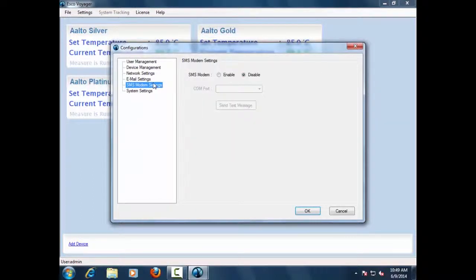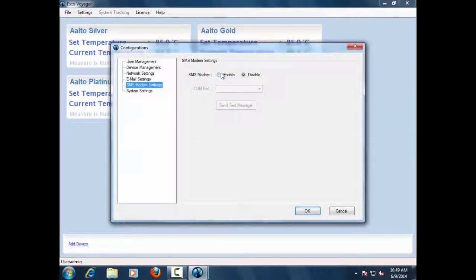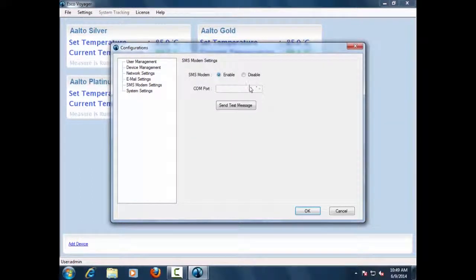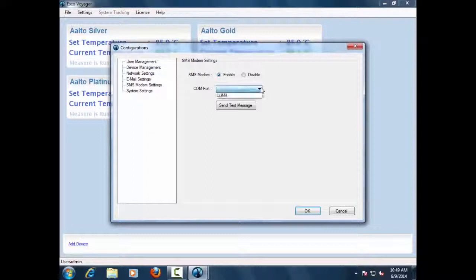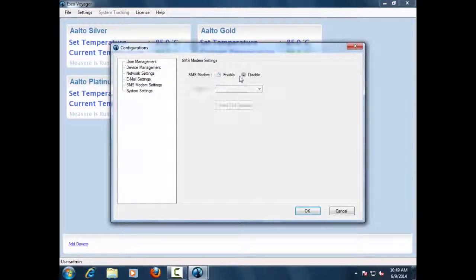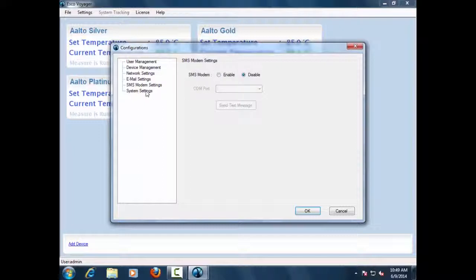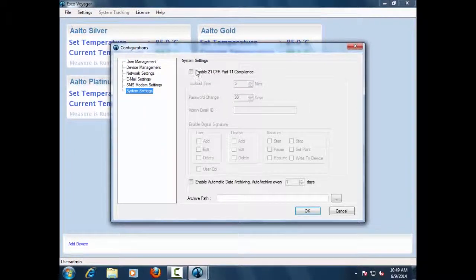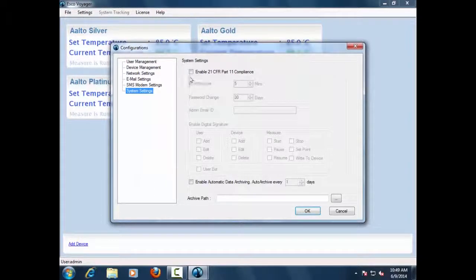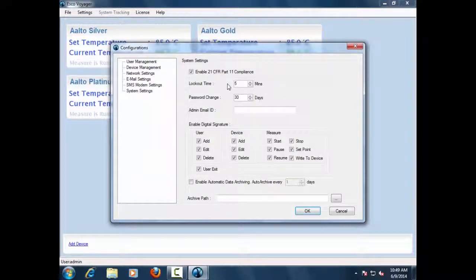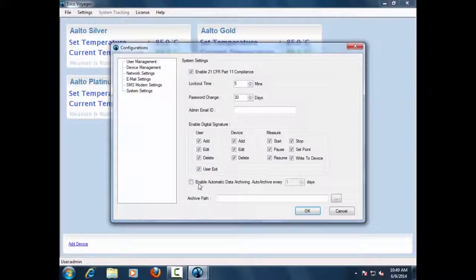SMS Modem Settings. This tab consists of settings that will help Voyager application send SMS alerts to the designated users. System Settings. This tab consists of settings that will help Voyager with 21 CFR Part 11 settings and data backup settings.